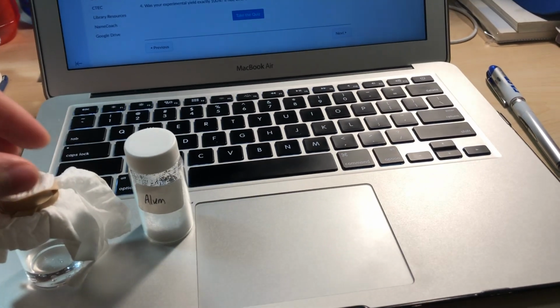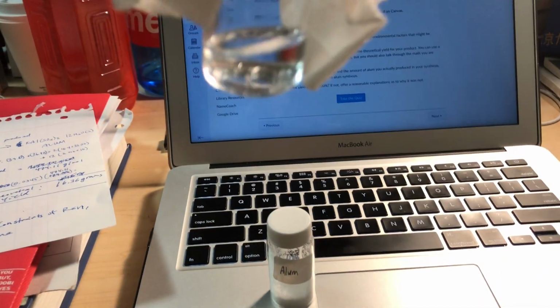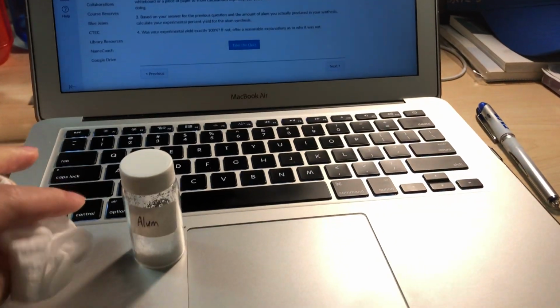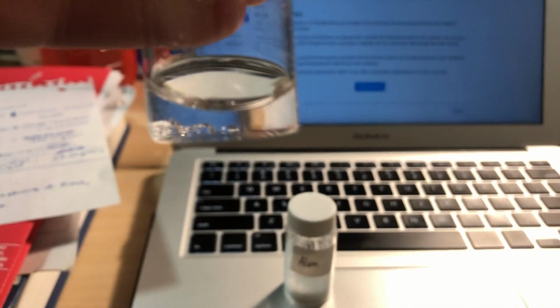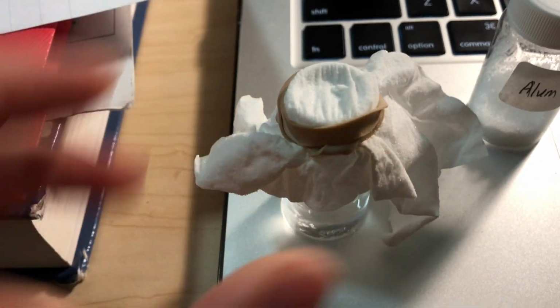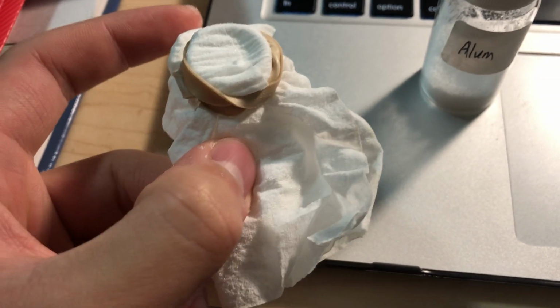than 100%. So to start off, this is our dissolved alum, and as you can see, there's some small formation of crystals there. Here, let me try to get it better a little bit. Yeah. So there's a small formation of crystals at the bottom. This is due to an accident which occurred in the first week where I actually spilled, or this was spilled, not by me, but by my roommate, and the small crystal particulates are actually on the Chem wipe, surprisingly enough, which is why the solution has less crystals than you would expect and also less liquid. And as you can see, it's kind of shiny from those crystals.